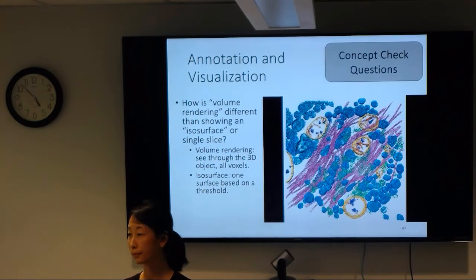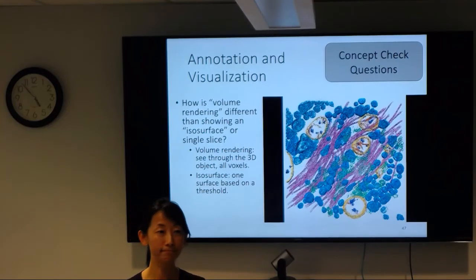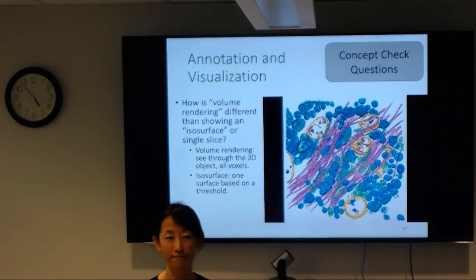That's how you show it. Okay, so it's kind of like looking at a density map. The appearance will be different depending on the threshold you set. Generally speaking, a lower threshold gives you a bumpier-looking density, but the map is the same map. Volume rendering will be a more realistic presentation of your data. You're basically looking at each voxel by value. Any question?